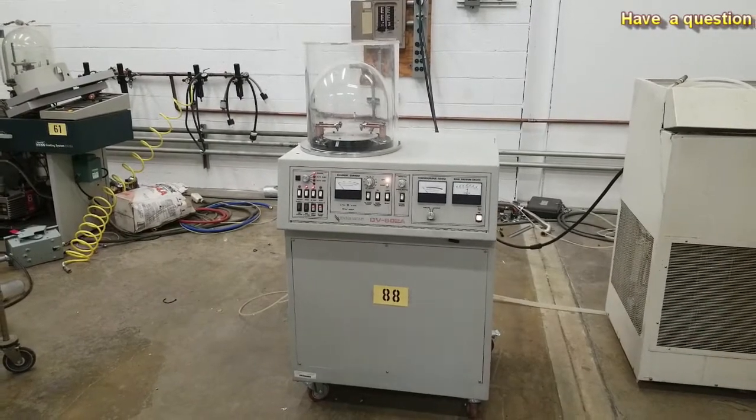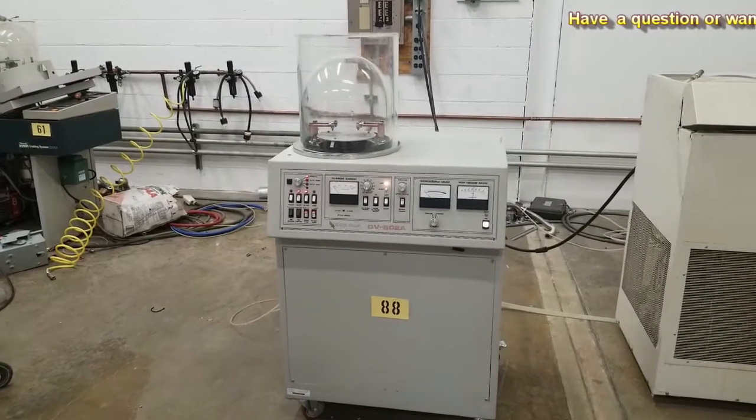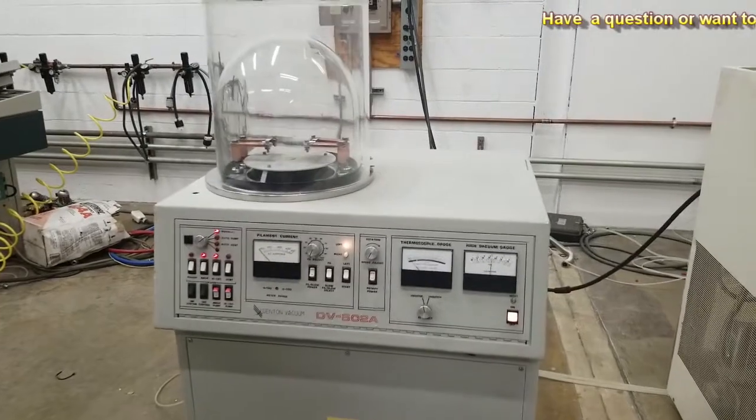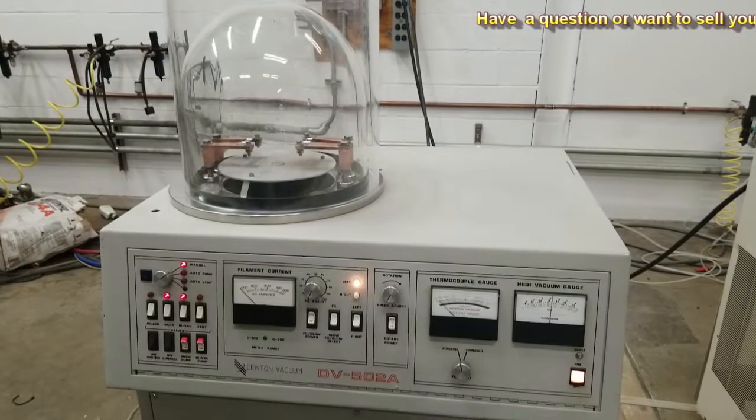This is a video demonstration of the Denton Vacuum DV502A. I just want to point out that this system has been upgraded with the Varian VHS-4 High Speed Diffusion pump.